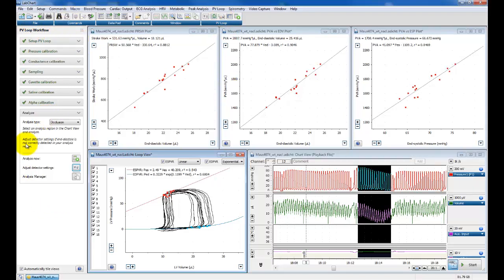And in fact, following this workflow seems to work incredibly well. We've just done this single entity here, but you can see how quick and easy it would be once you have the saline, cuvette, and other calibrations, just to enter the numbers. So there we have it.